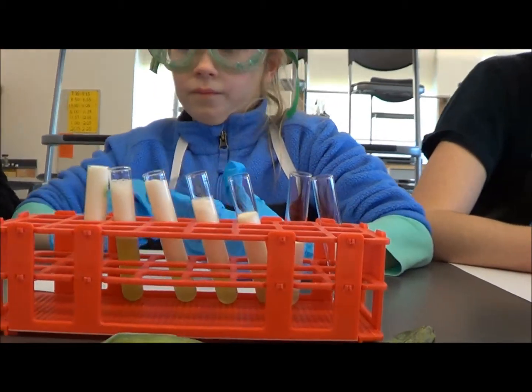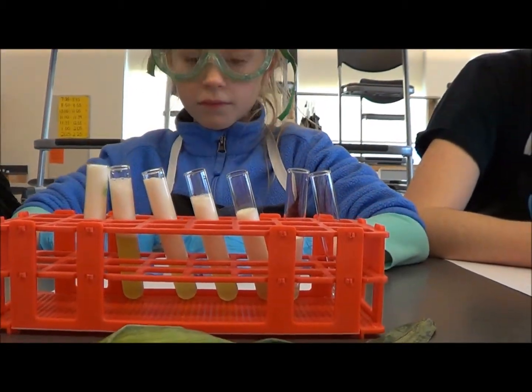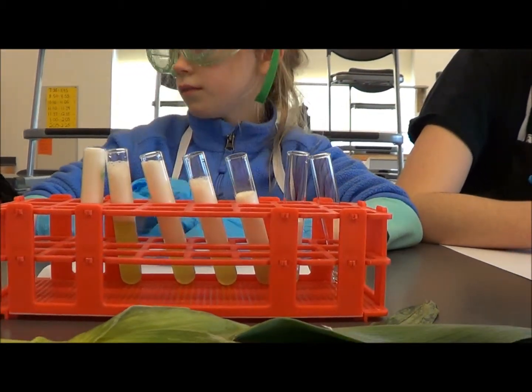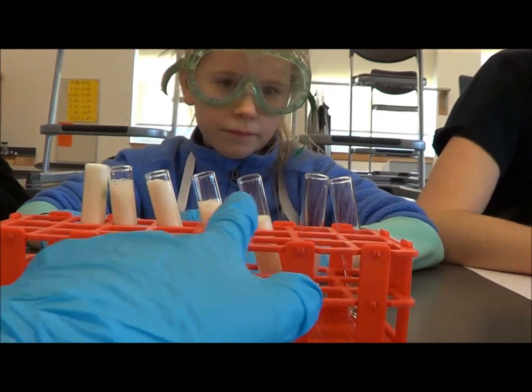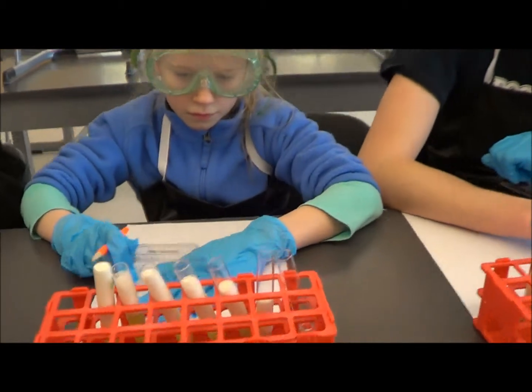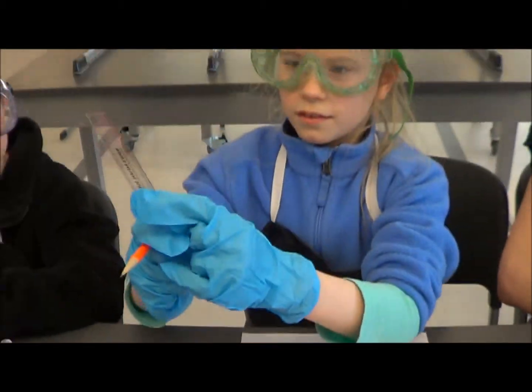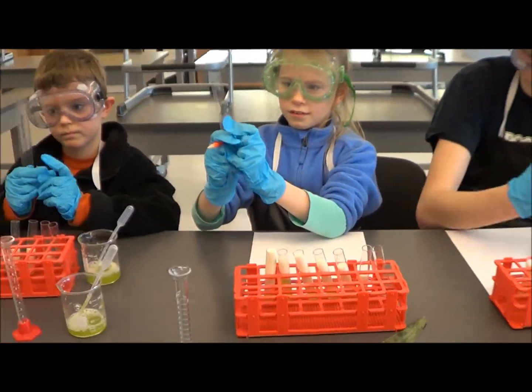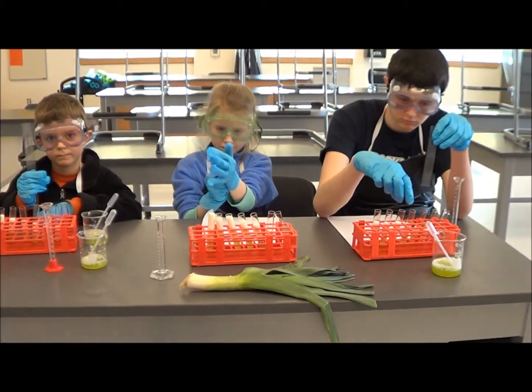What we've done now is put in the enzyme and the hydrogen peroxide, and you can see you get fewer bubbles over here and more bubbles over here. Now each of the students is going to take the ruler and measure in centimeters - all you're going to measure is the bubbles, not the green stuff underneath.